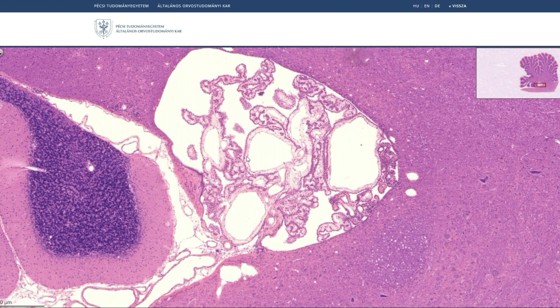In the middle of the photo you can see the choroid plexus of the fourth ventricle, which is not surprising because the cerebellum is in the vicinity of the fourth ventricle. Even at this magnification you can see the simple cuboidal epithelium lining. It is quite a vascular structure, so you see vessels of different sizes with endothelium lining.